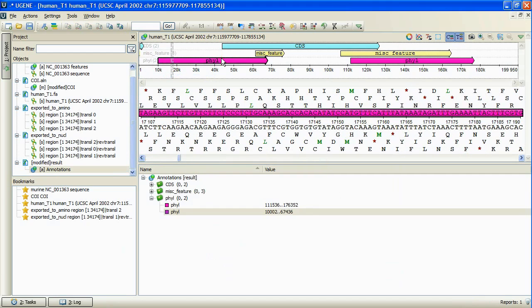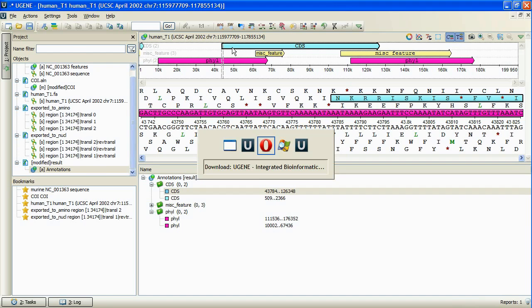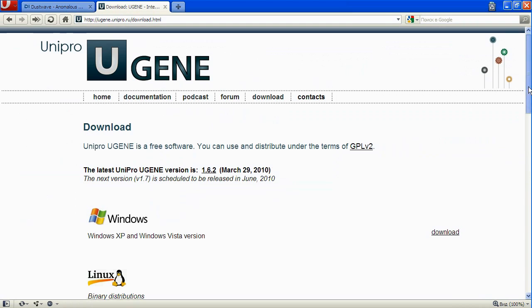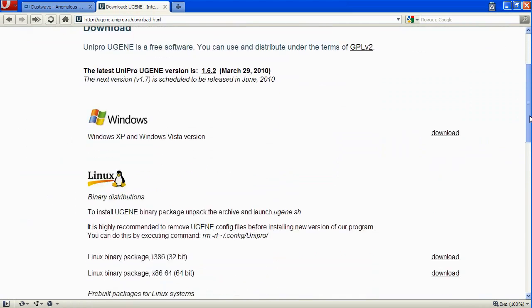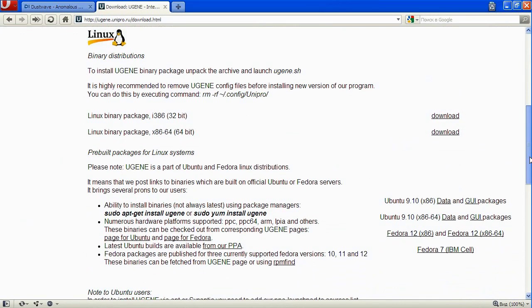We conclude our What's new in UGENE presentation with mentioning of new Linux UGENE binary packages. We get back to our download page. In the Linux section, there are two new links to the 32 and 64-bit versions of the binary distributions.